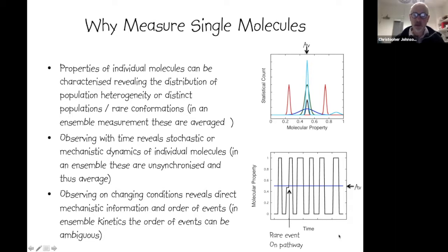Another feature about single molecule measurement is it allows us to pick up rare events or low populations of species, which may be biologically important.